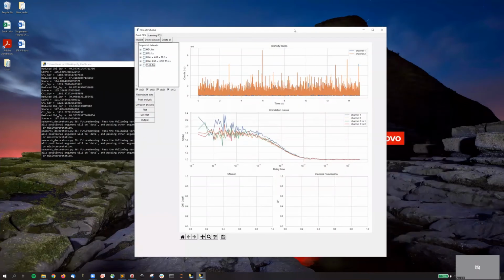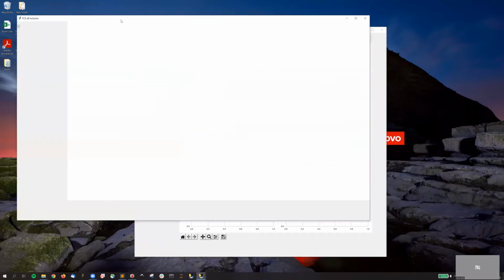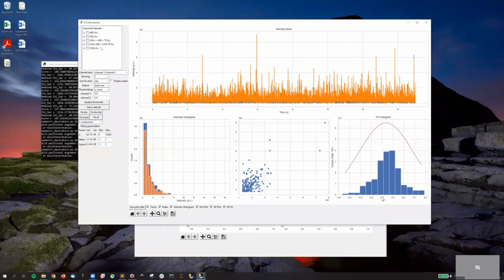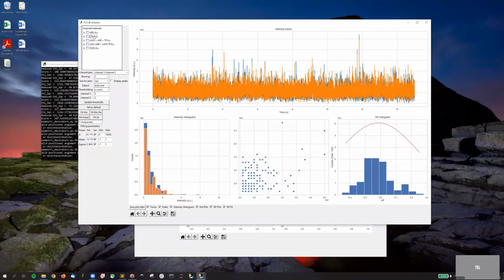The second type of data where this approach can be used is the data for biophysical profiling. And for this, we have our lipoproteins, HDL, LDL, and VLDL. And of course, everything starts from the peak analysis. And in peak analysis, again, you have your high-density lipoprotein, low-density lipoprotein, very low-density lipoprotein.